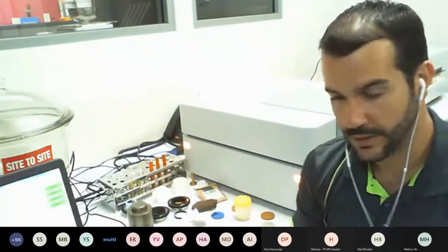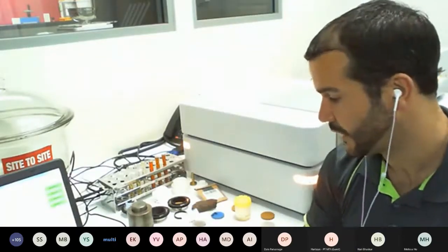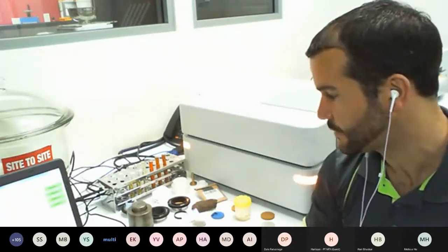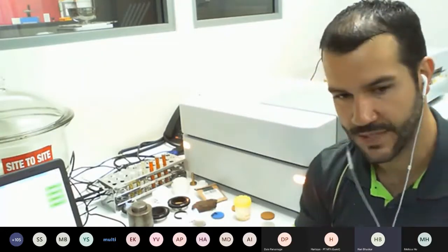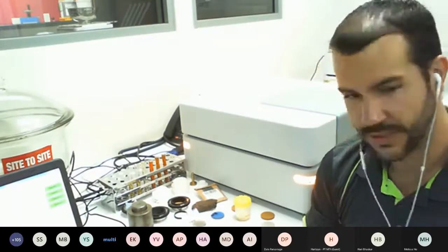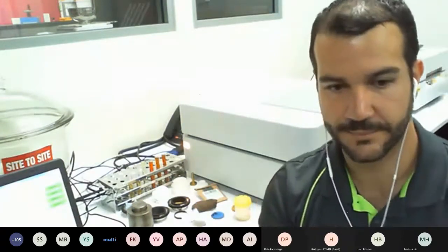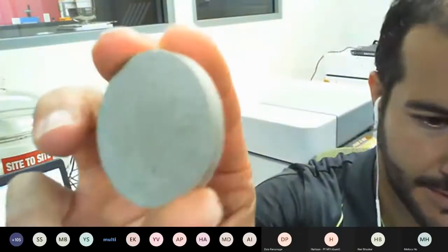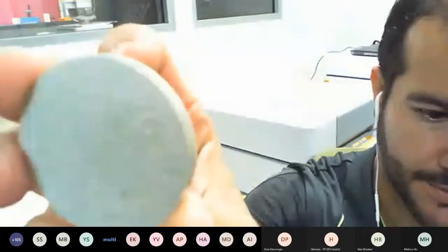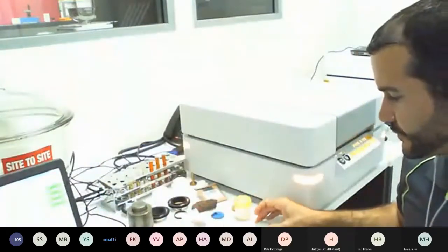And so what we're looking for in a good pressed powder sample is a uniformity of particle size. And so that helps the pressed surface, what's presented to the X-rays, be as smooth and flat as possible. It also helps the sample to stick together, which is really beneficial, less to clean up. And I'm not sure if you can see it, but because most samples will press together, try and get this up nice and close to the camera. And you can see that that has quite a marbled effect, and that's due to the differences in the particle size of the individual components in there.